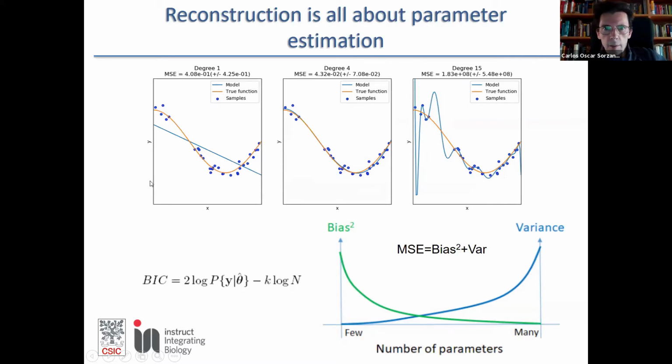So all this is about parameter estimation. What are the parameters of your model? The parameters for us are all the parameters for the intermediate states. So you have to align your frames, you have to decide which are the particles, and from where each particle is seen. And then at the end, what you will have is a full model, that is the map, that is compatible with your images.